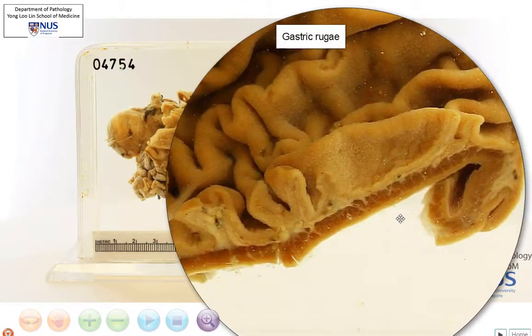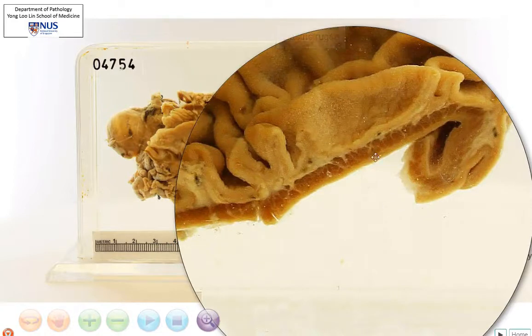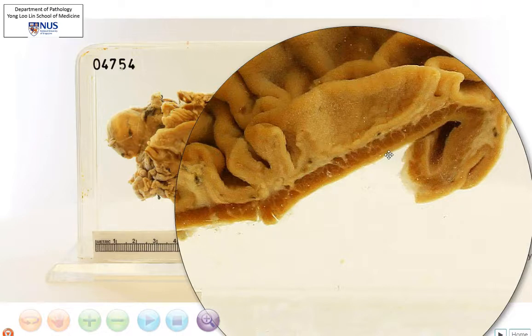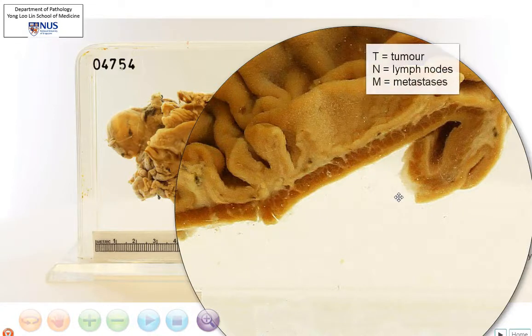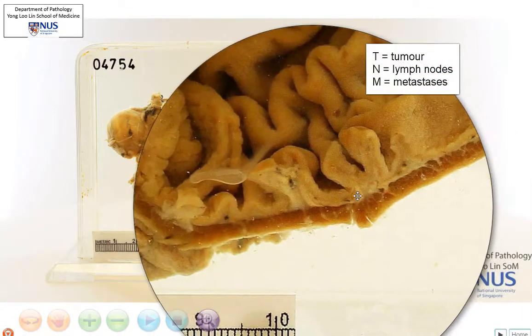If we look at the cut section of the wall over here at the greater curve, we can see this is the mucosa, this region is the submucosa, this thick brown line here is the muscularis propria, and just below that is the subserosal tissue, and then over here is the serosal surface. It's very important to know these layers because they are important in tumor staging — the TNM assessment of tumor stage.